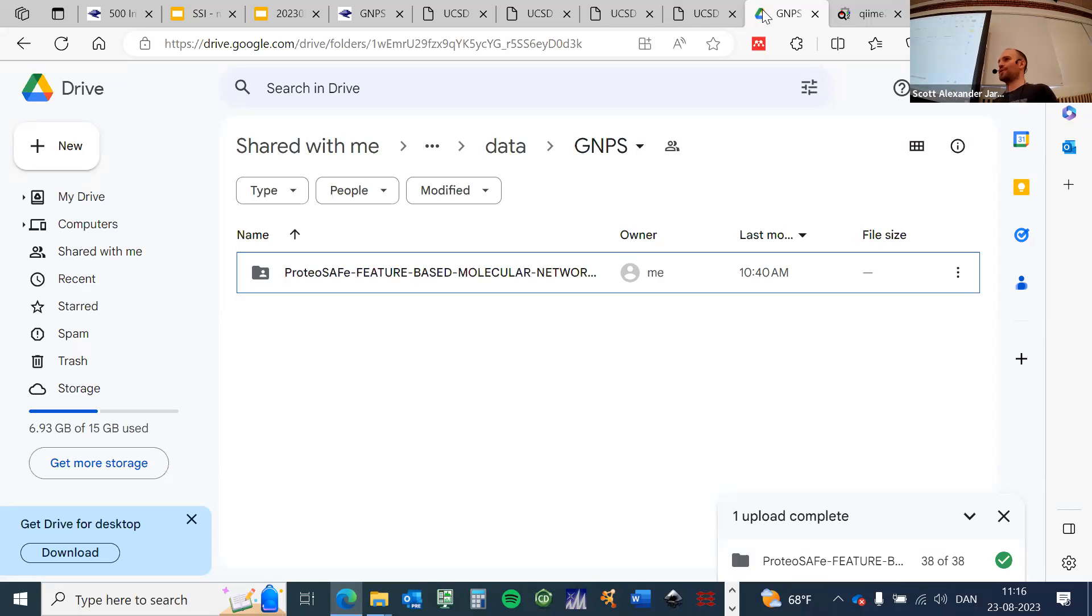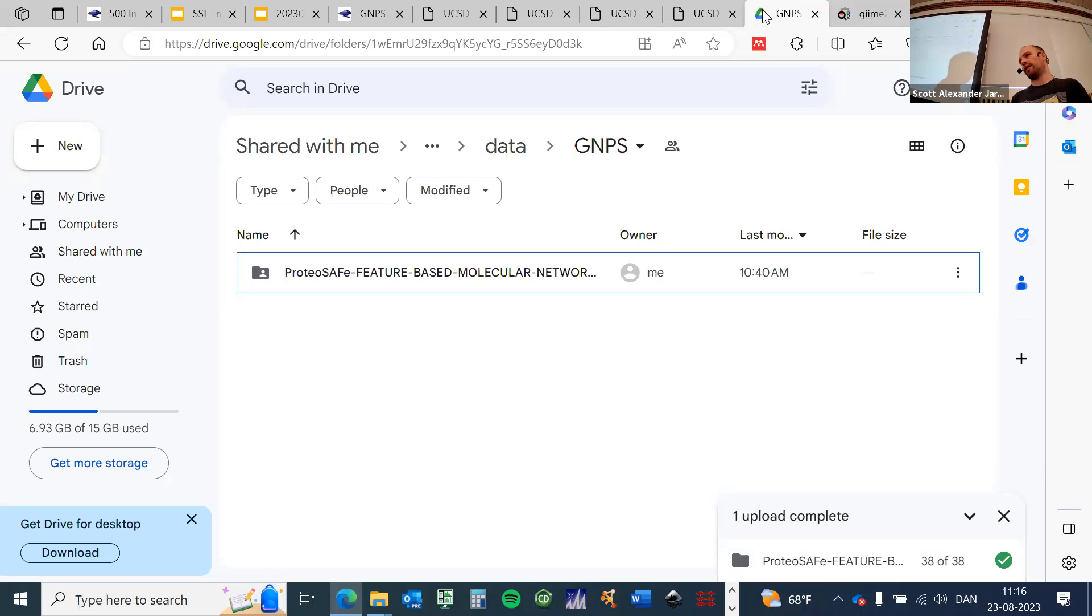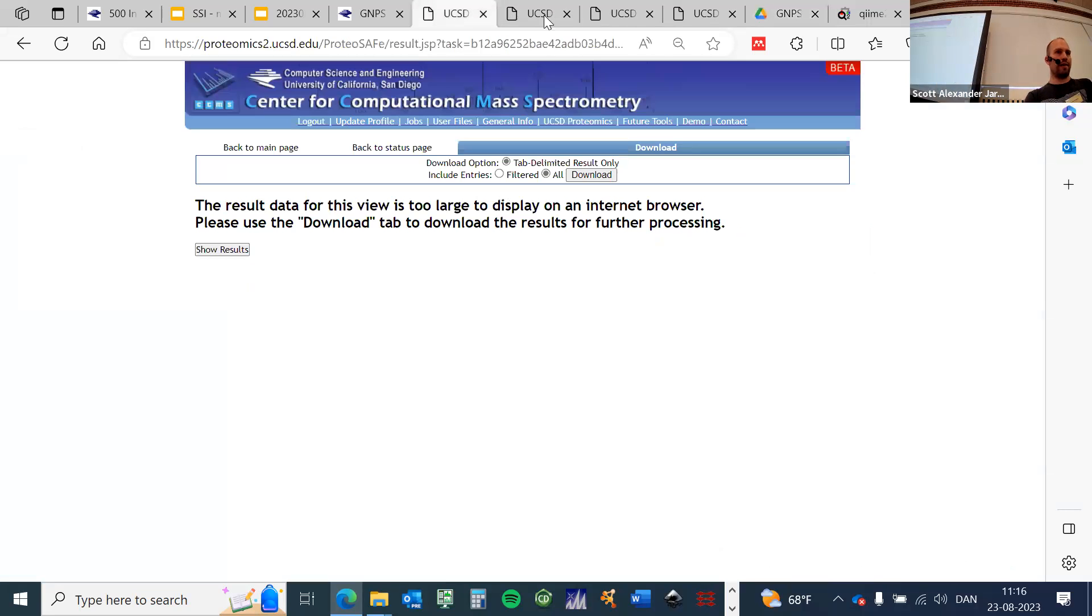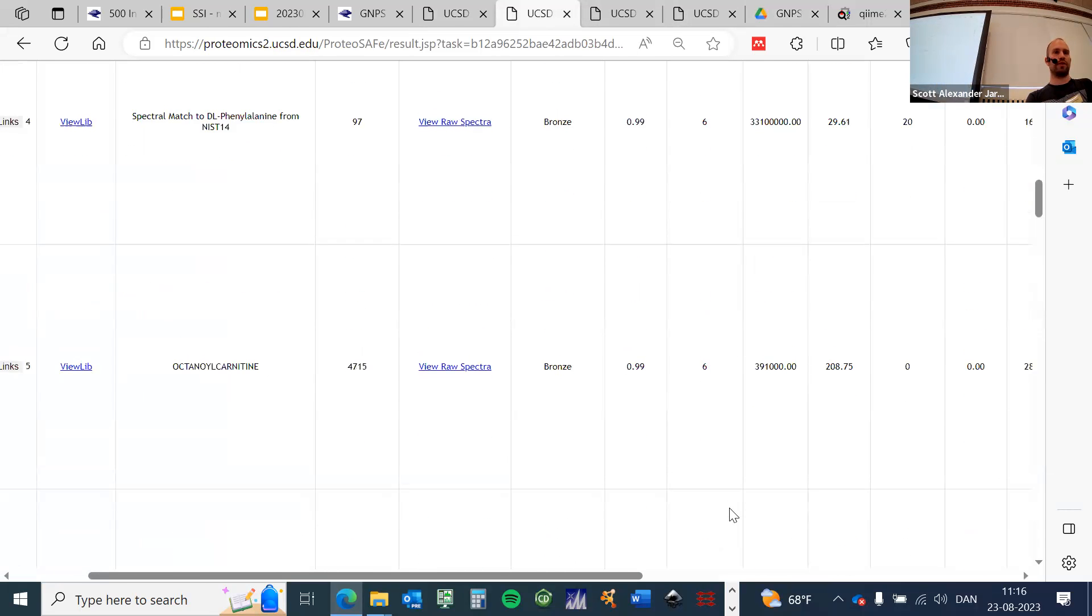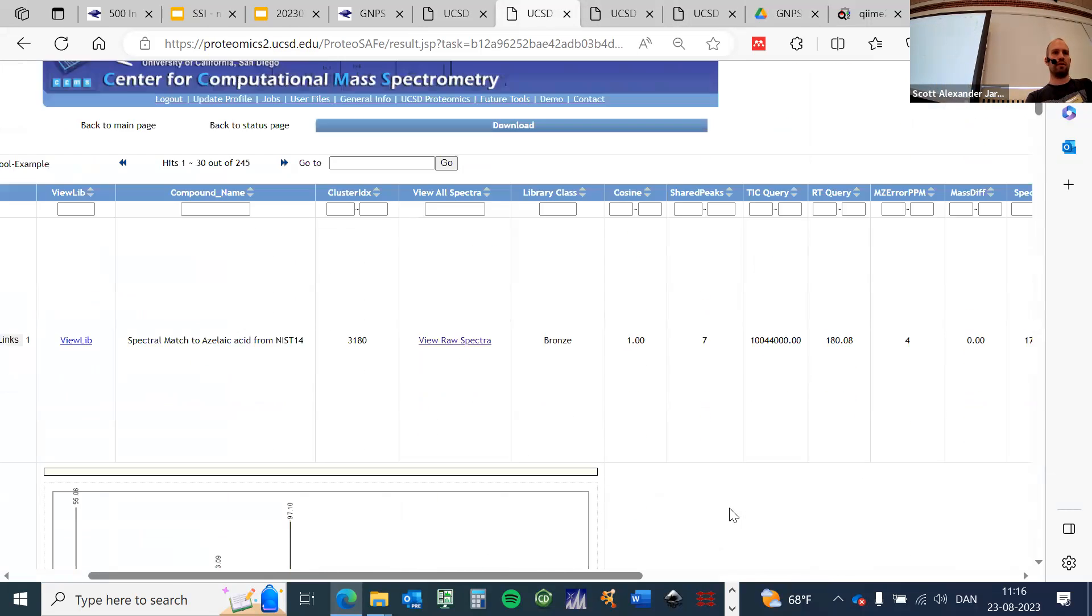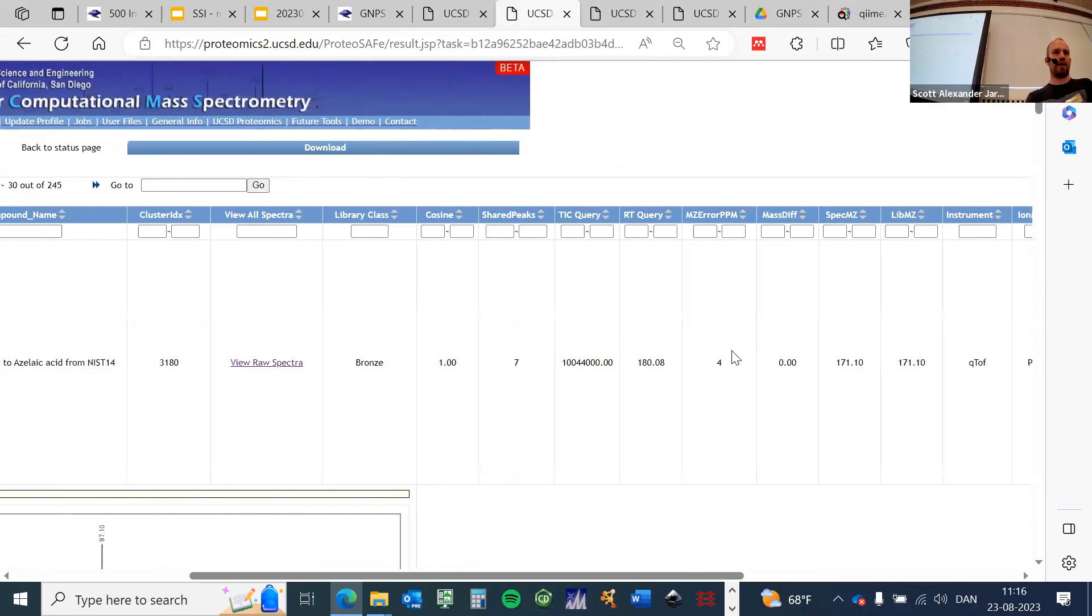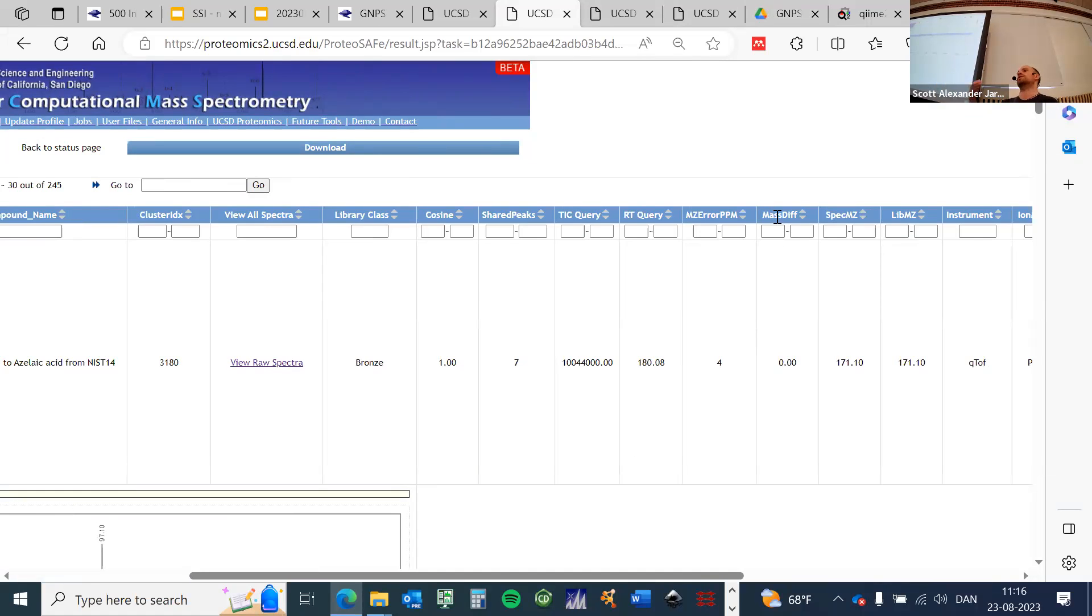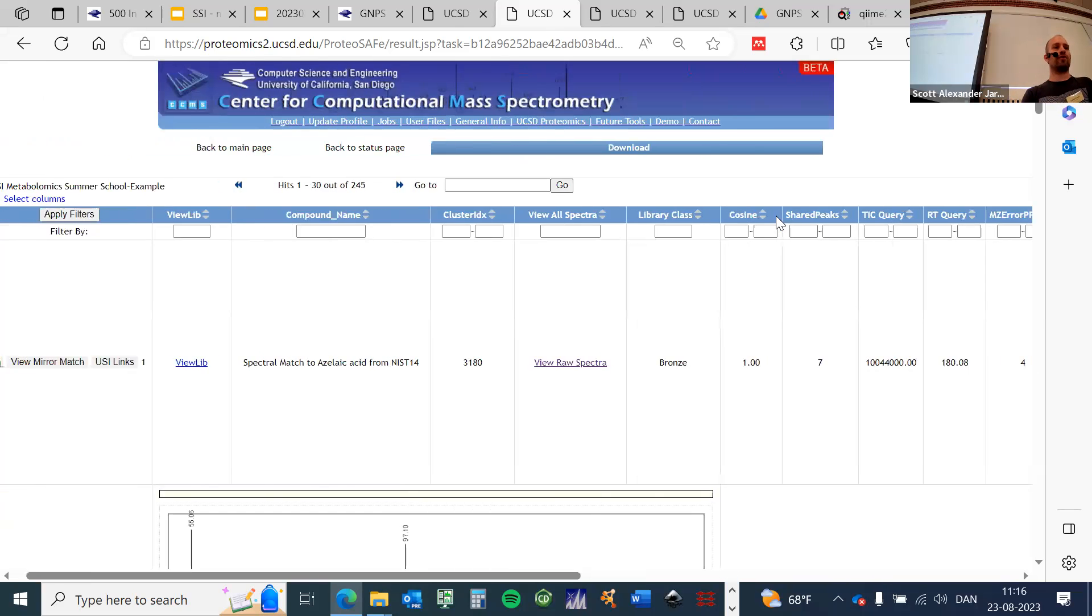Very good question. The question was whether we will only get library hits or also similar compounds that were annotated. If we select analog search, then you will also get the analog matches. Then there will be another very important piece of information: this is the absolute delta mass, which then obviously will contain matches that have a higher mass difference. Here there is this mass difference, and then if you would get an analog match, you would have to have a larger mass difference here. So this is akin to open modification search and so on.